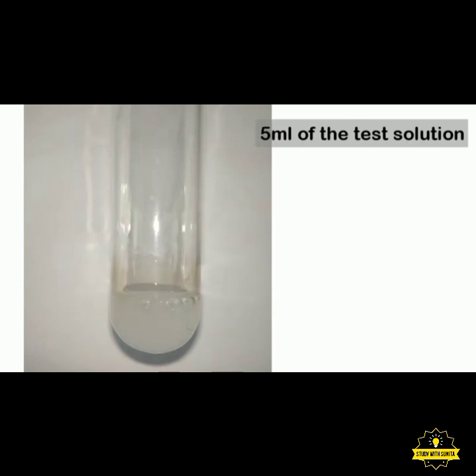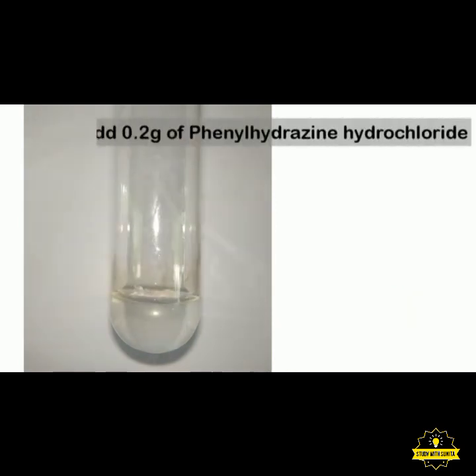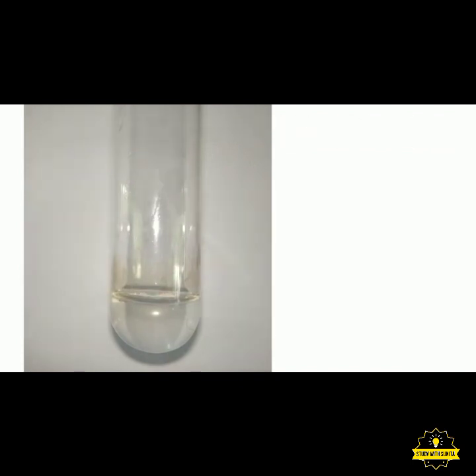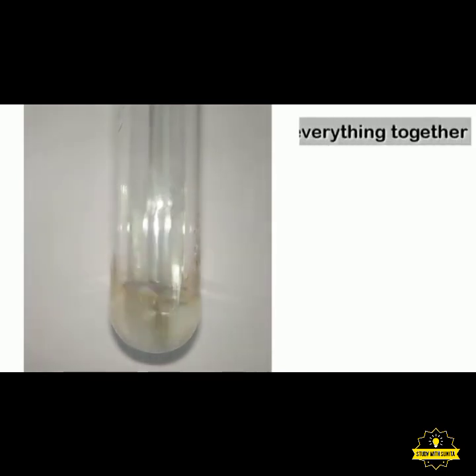At first we take 5 ml of test solution in a test tube. Then we add 5 drops of glacial acetic acid. Now add 0.2 gram of phenylhydrazine hydrochloride. Now add 0.1 gram of sodium acetate. After adding all these compounds, we mix everything together with the help of a glass rod.